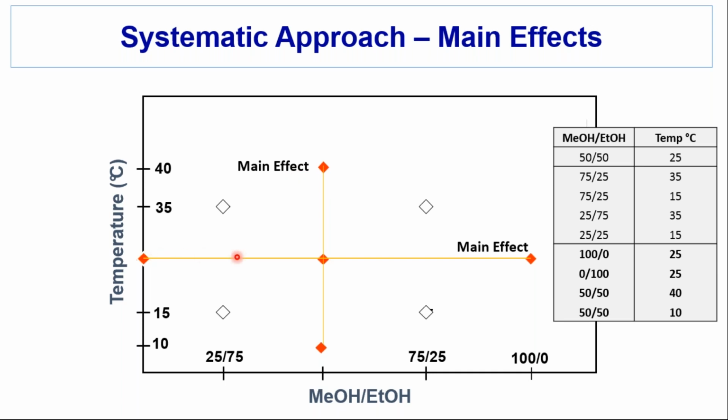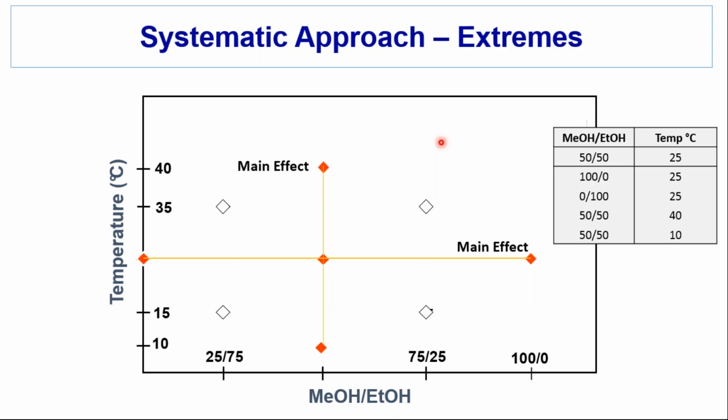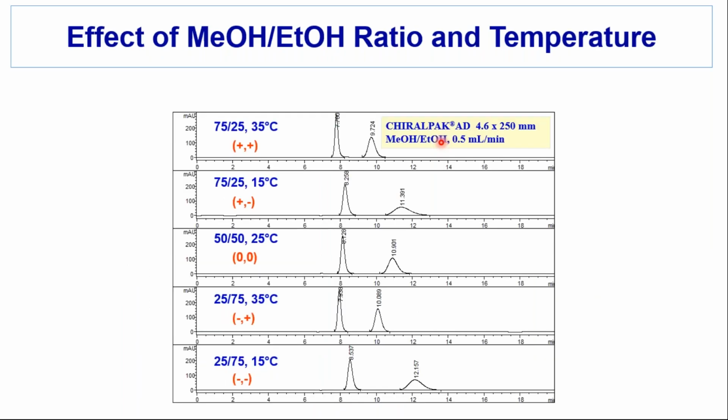And I would certainly at least have the center point and perhaps some other data points along this. I often use central composite design because it is more space filling and gives us more information. But certainly, at least just the main effects is probably an experiment worth running. So this is an experiment that I ran, separation. This was a screening condition. It had pretty good separation, 1-to-1 methanol, ethanol.